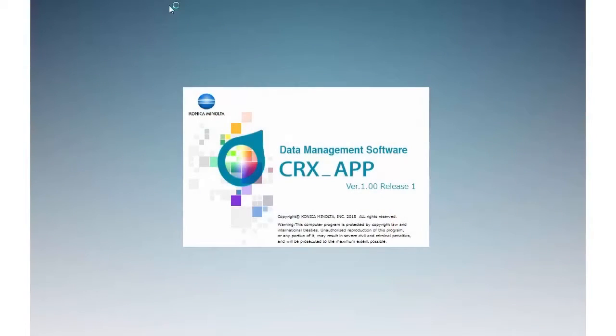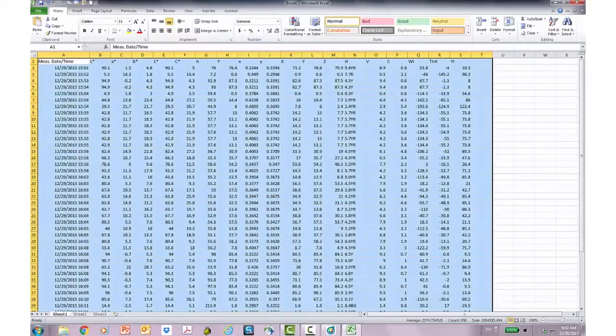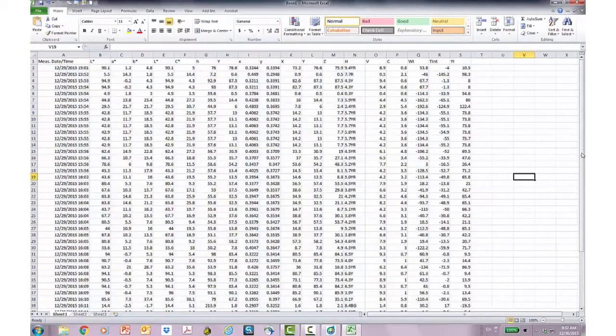You can set measurement conditions, store 1,000 readings on the instrument, upload measurement data into the included software, and then paste into Excel for further analysis.